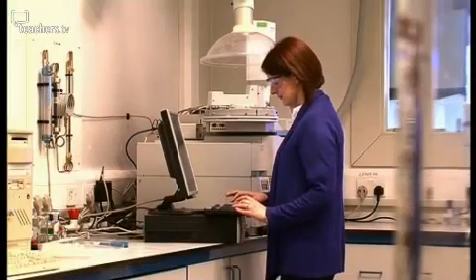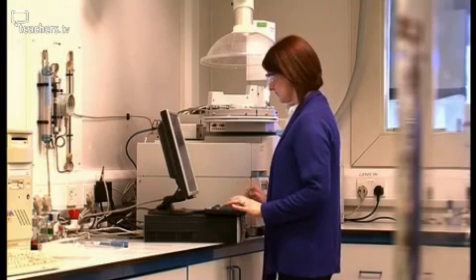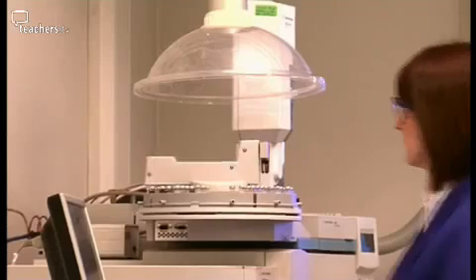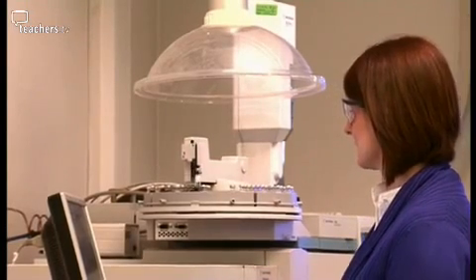Giving it a go meant firing up the GCMS to test the fly pupae casings. Gas chromatography, mass spectrometry, or GCMS, it's combining gas chromatography with identification using the mass spectrometer. So the gas chromatography is for a separation technique on its own. However, the identification comes from the mass spectrometer. So by combining the two together, you have a really useful instrument in forensics, in chemistry, in science in general.